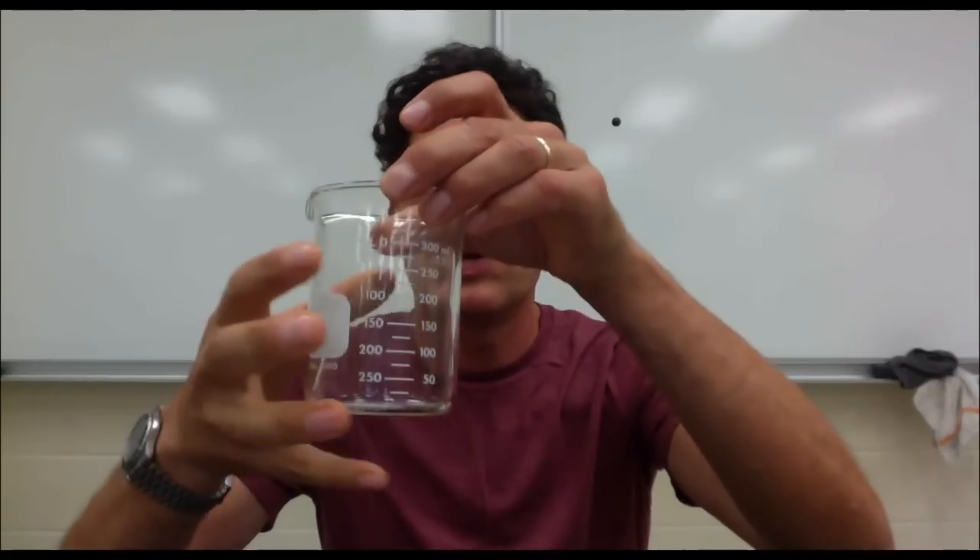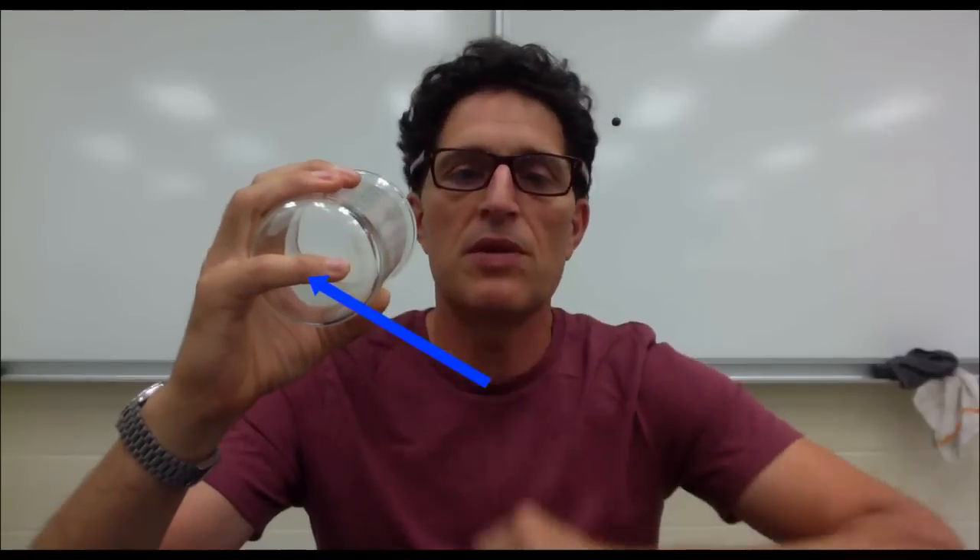We solve that problem by putting our pinky like this on the bottom of the beaker, so that there are three points of contact: one, two, three.